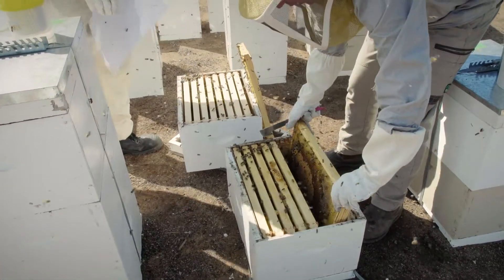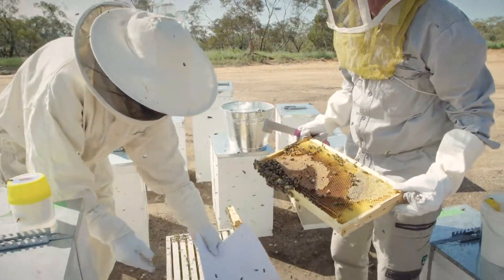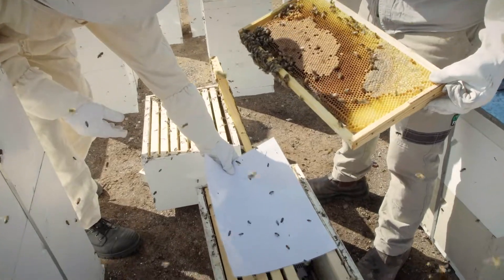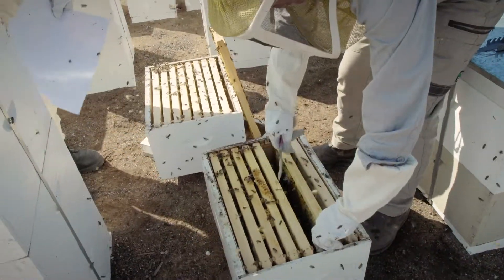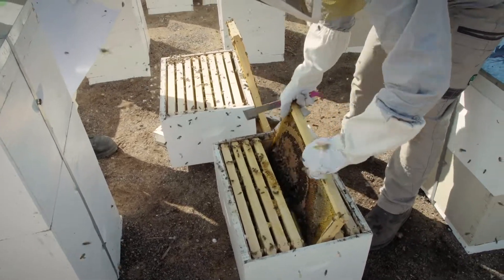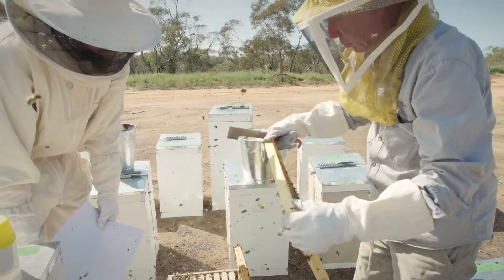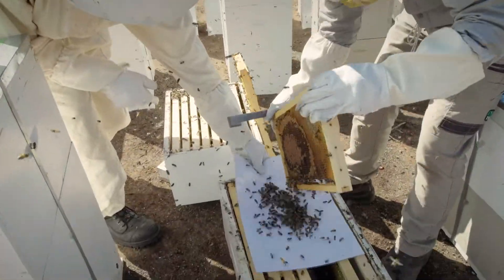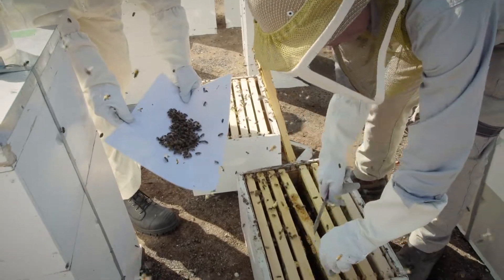The next step is we want to get around about 300 nurse bees. What we're going to do is shake them onto white paper and get them ready to go into an alcohol wash. We'll go to the next frame where there's a few more bees — check no queen — and drop some on here, then go to another one. We want to get nurse bees from across the brood nest.